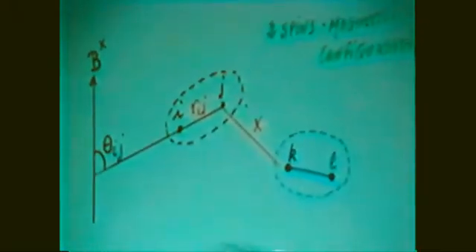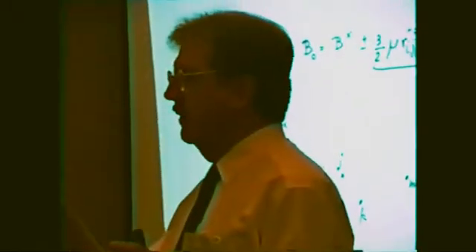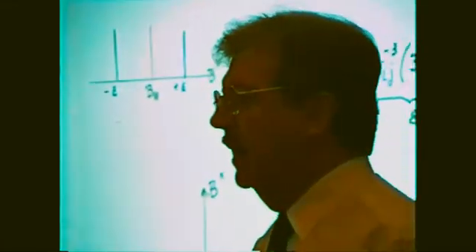And so we absorb water at room temperature. We use high resolution NMR for determining the concentration of the different OH groups. And after, we quench the sample in liquid helium, and we have verified that we keep exactly the same equilibrium. And we study now the dipole interaction.